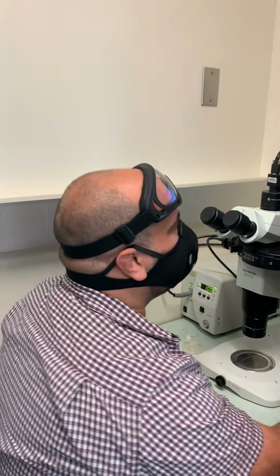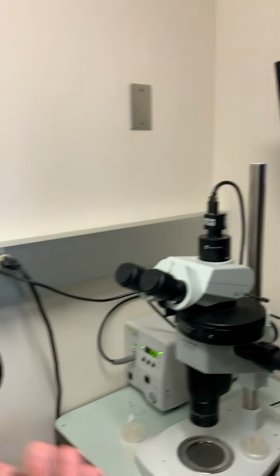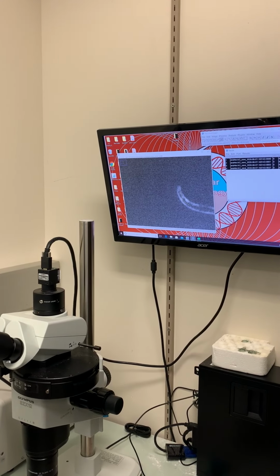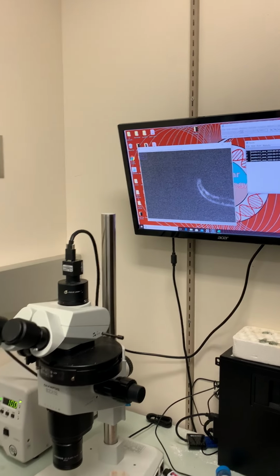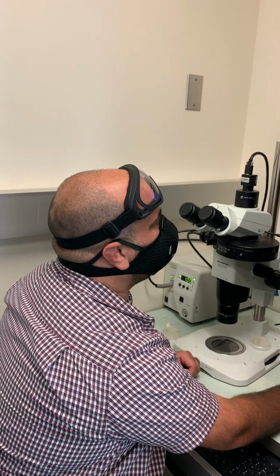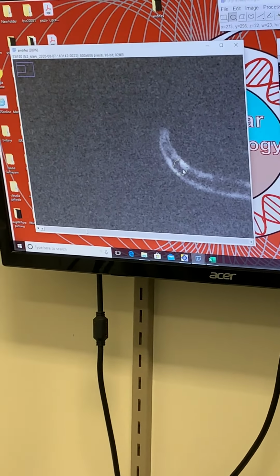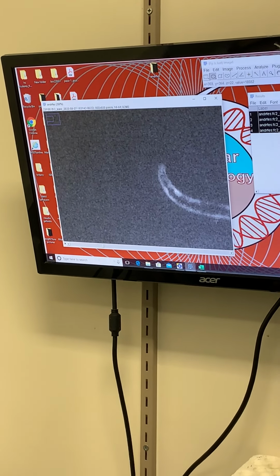That's the measurements that you need to make from this, and I do it in 3 passes. I go first pass, I get all of the ventral or dorsal to one side, copy that, then I go back, get all the other side, and then I go back and get the angles, and I take super extra time with the angles. The circle here, as I mentioned, is more forgiving, so as long as you don't make it too big, as long as you don't put it like that it bites into both muscles, you're gonna be okay. But the angle really matters. So spend more of your time in there.